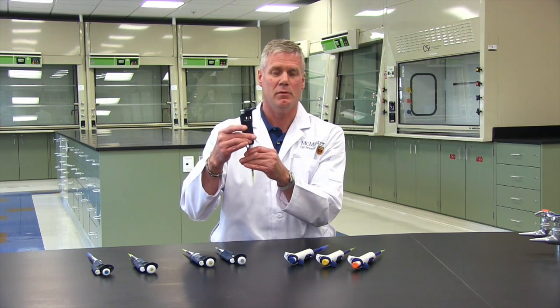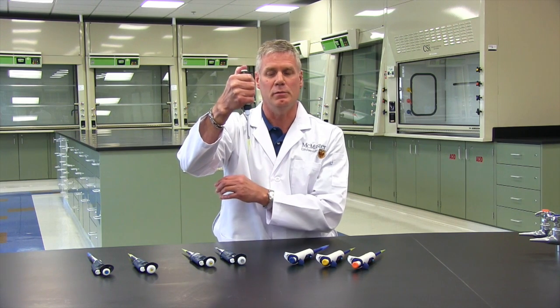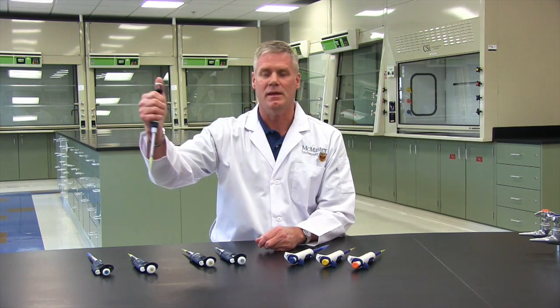Within the body of the micropipette is a piston within a sealed sleeve. When you press down on the plunger, air is forced out the bottom of the tip. When you then put that into a liquid and release the plunger upwards, it creates a vacuum that draws the liquid up into the tip. You can then put that into a test tube or another beaker if you want. Let's take a closer look.